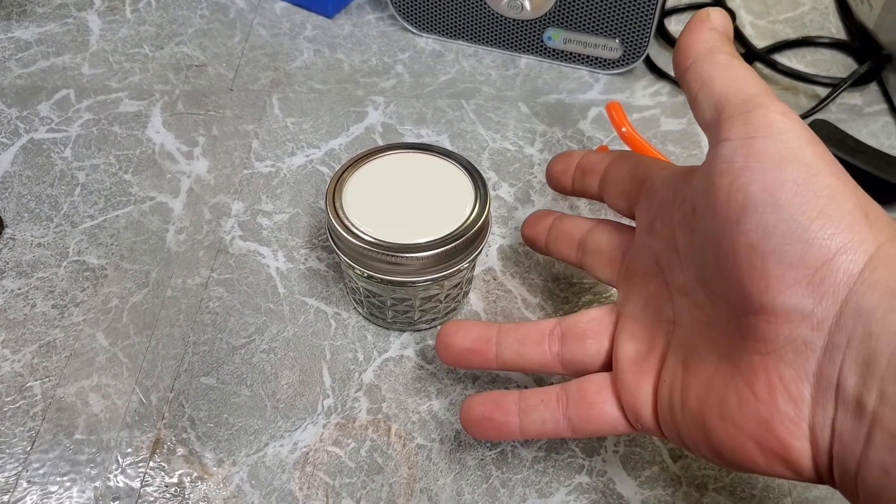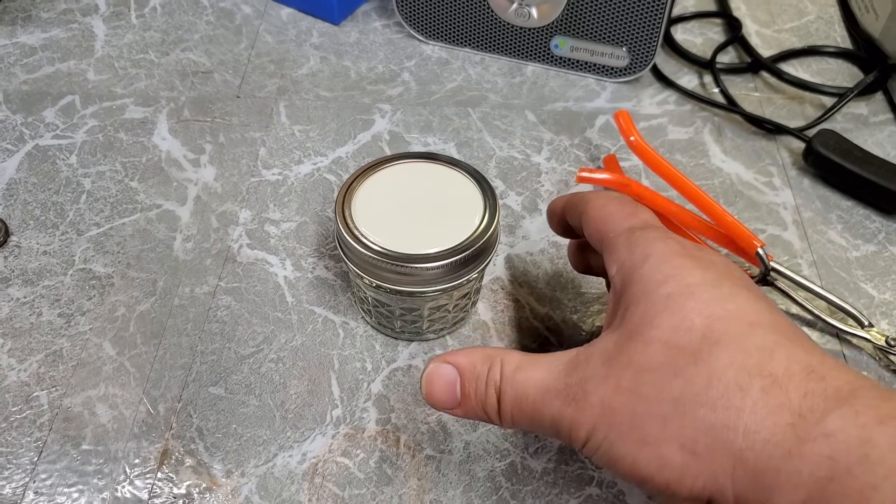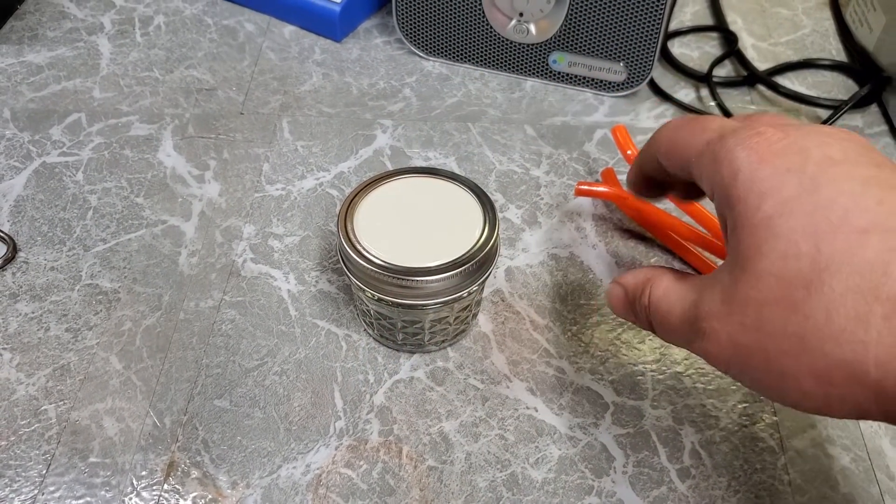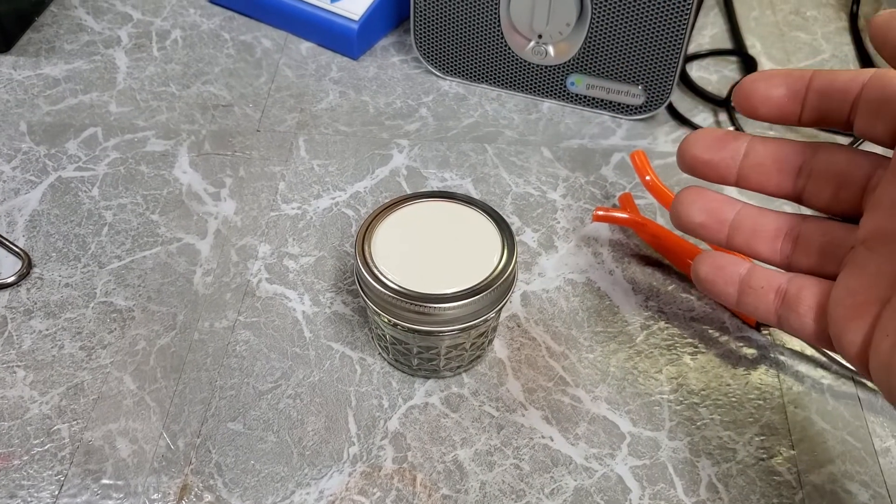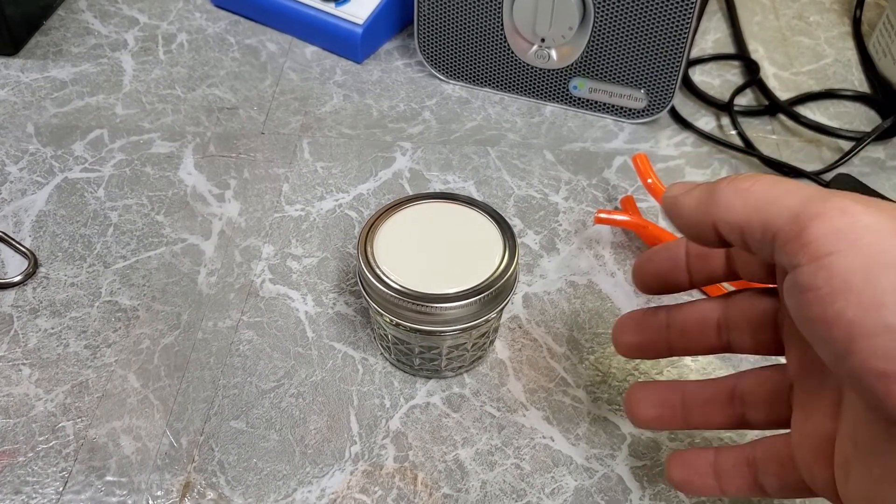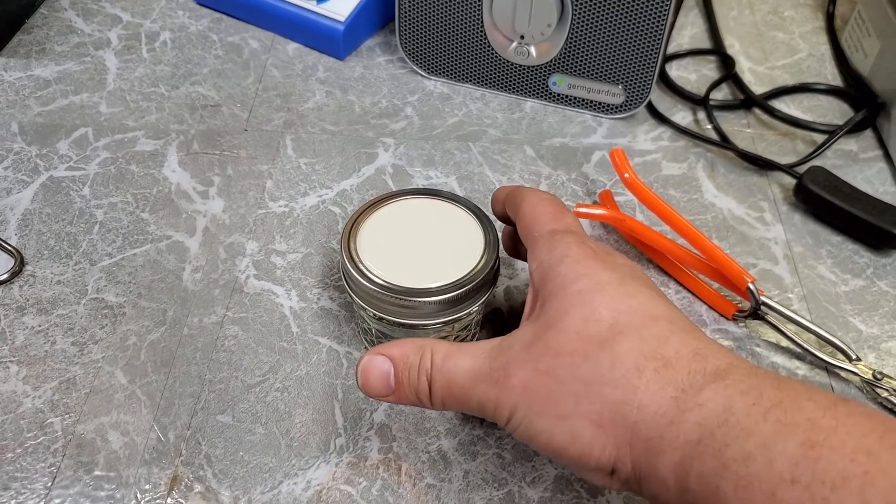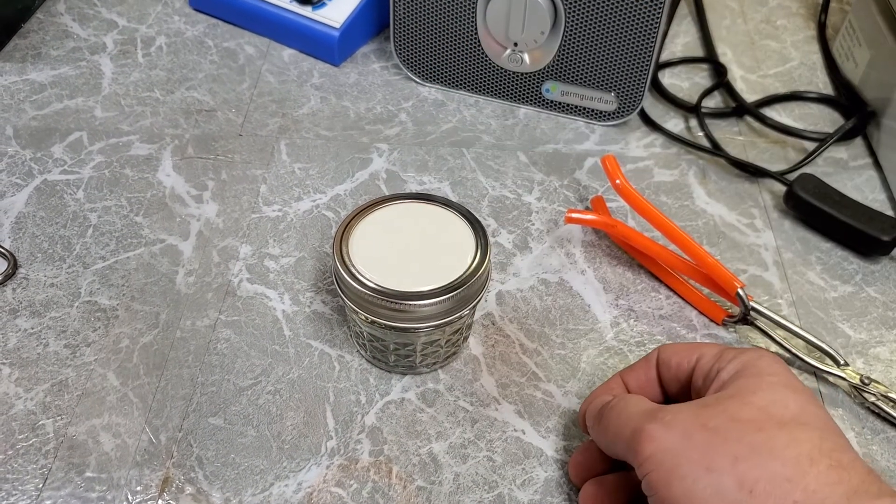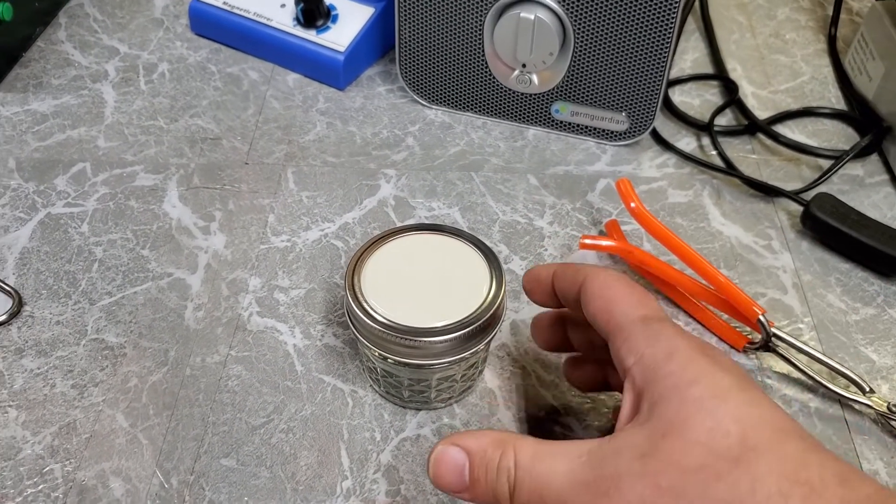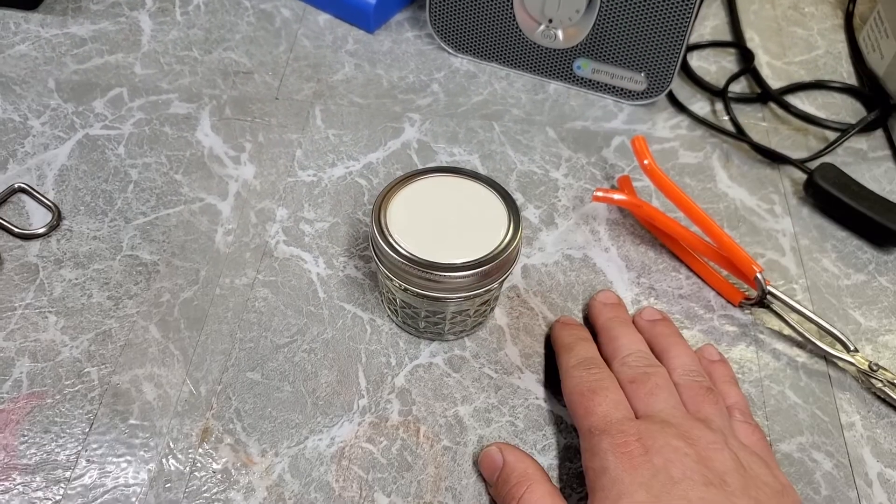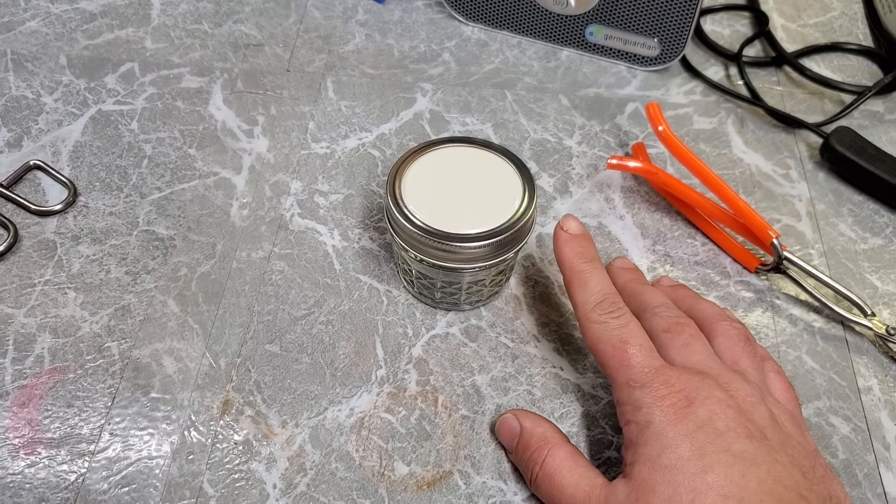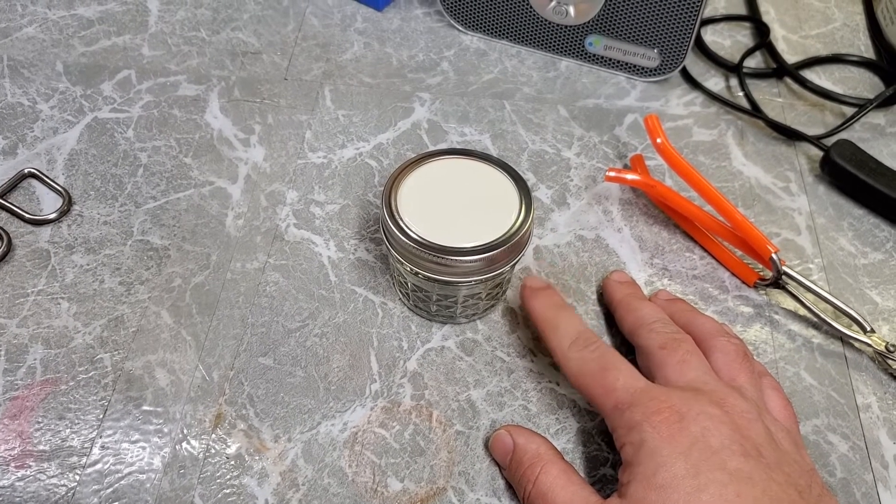Once this is colonized to the point that you want it, you can either shake it up, break up the mushroom mycelium, and then you could pour that into other jars and kind of exponentially grow your liquid culture collection or your liquid culture stock. Or once this is colonized to the point you want, you can just pour that colonized liquid culture onto, say, a sterilized rye grow bag. It's really all there is to it. This is a very simple and foolproof way to make liquid cultures for your mushrooms.